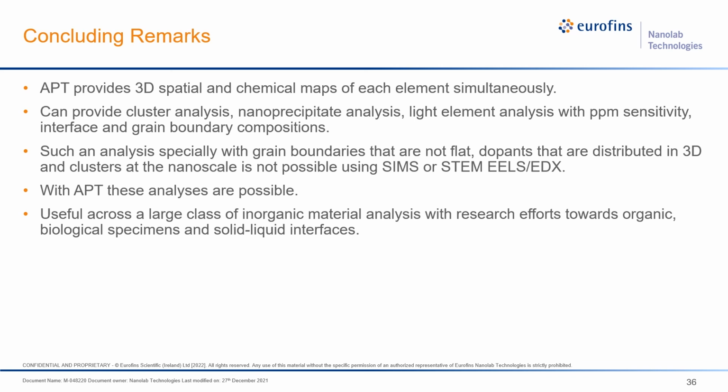It is also very useful across a large class of inorganic materials, and there are continuous research efforts to expand the use of APT towards organic and biological specimens, as well as solid-liquid interfaces, through the use of cryogenic techniques and vacuum-based transfer systems.